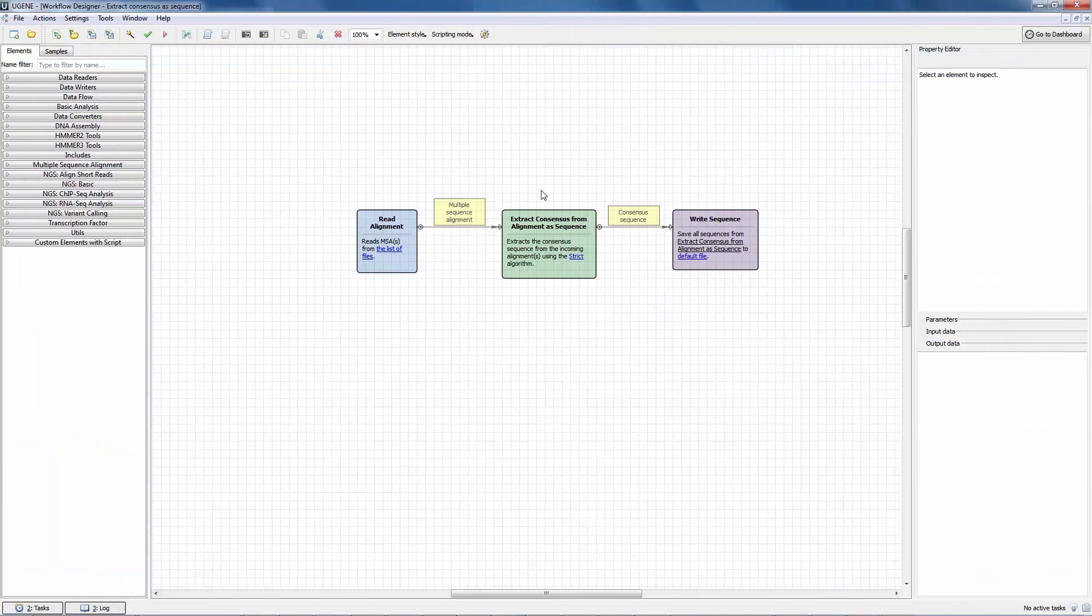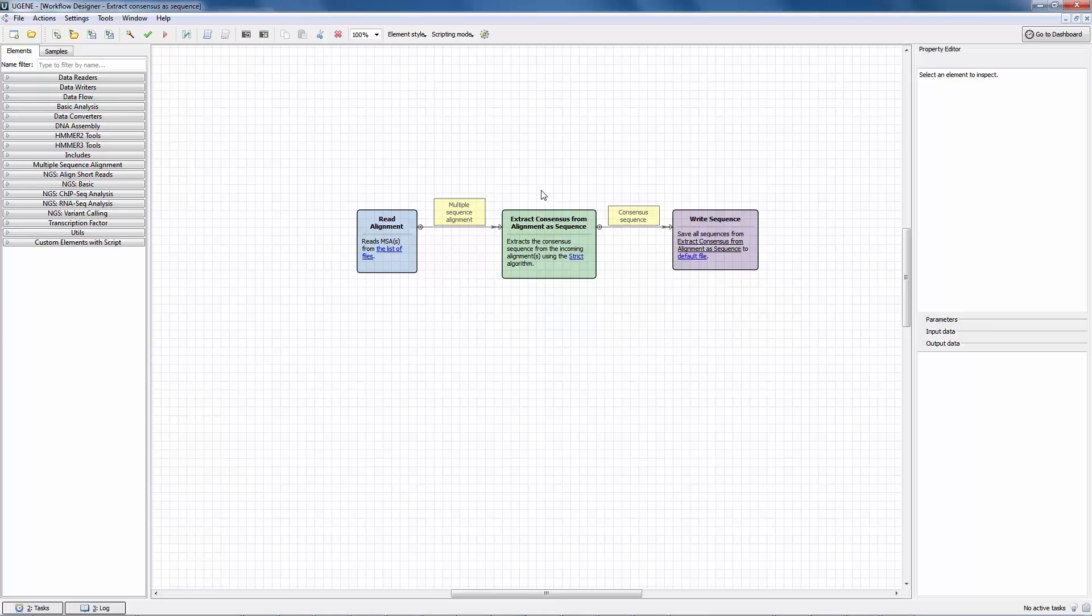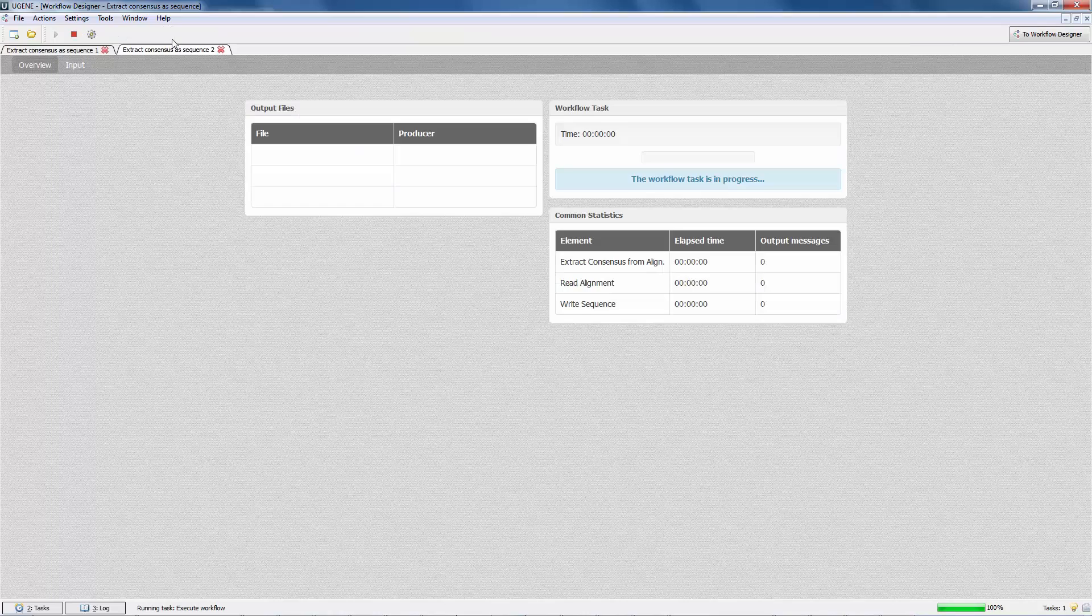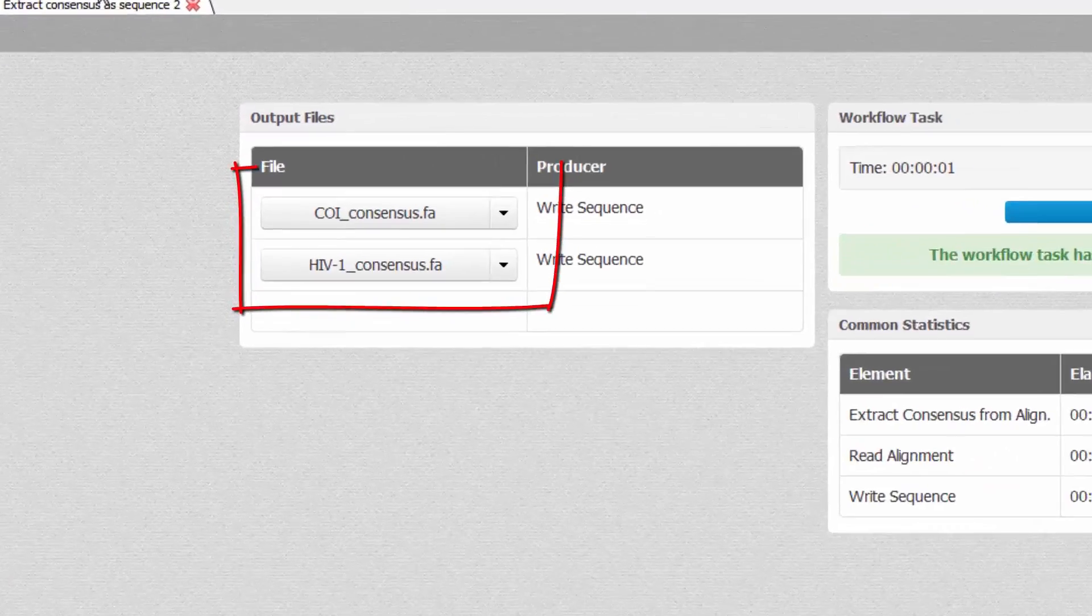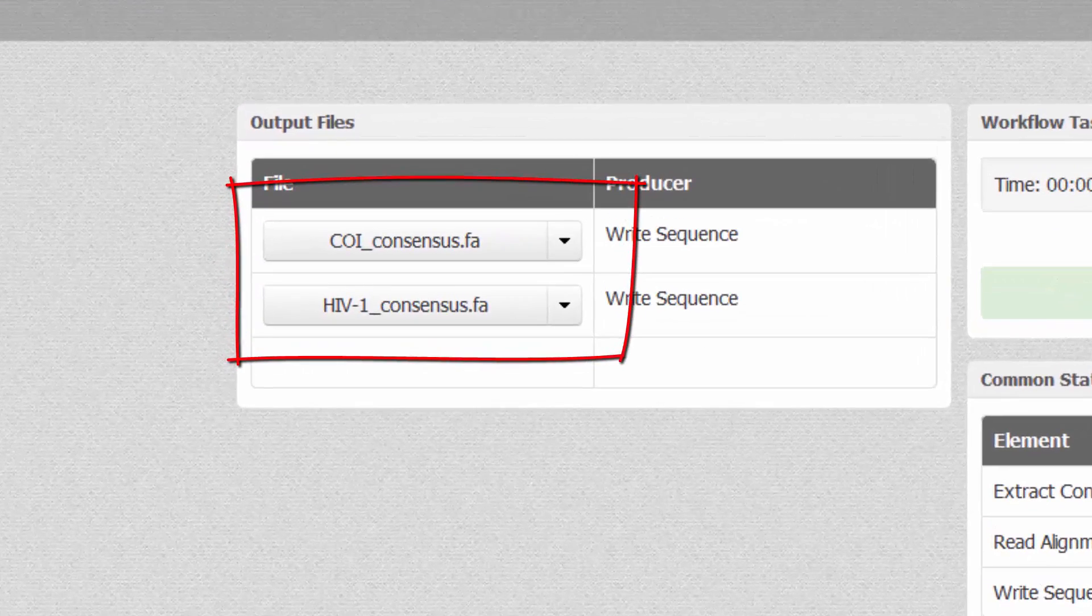Second, the workflow designer usability has been improved. If you do not specify a name of an output file, then the name will be generated automatically based on the name of an input file or a data set.